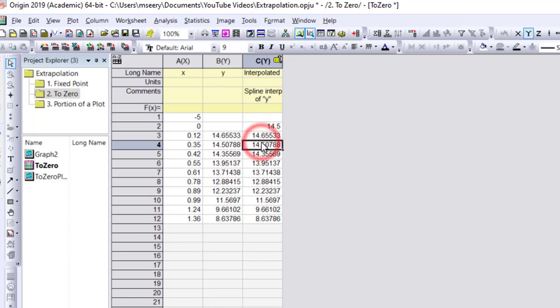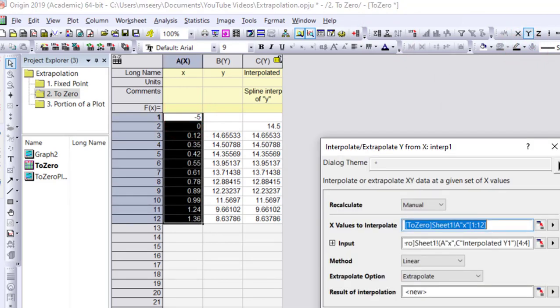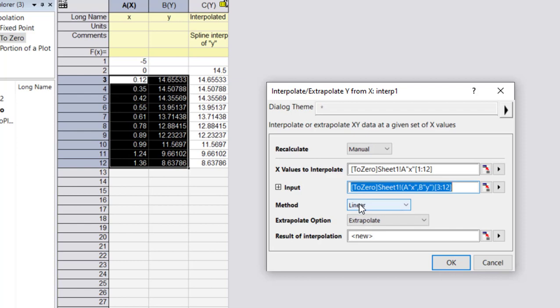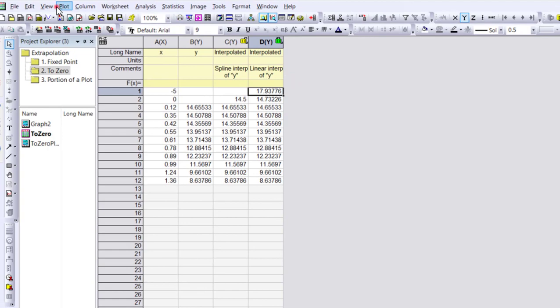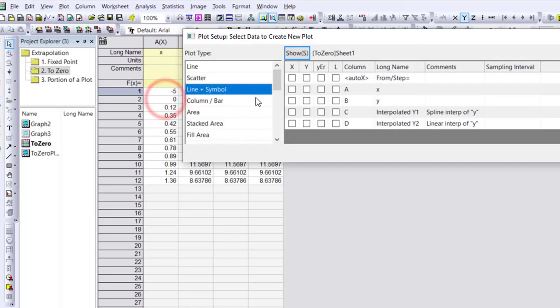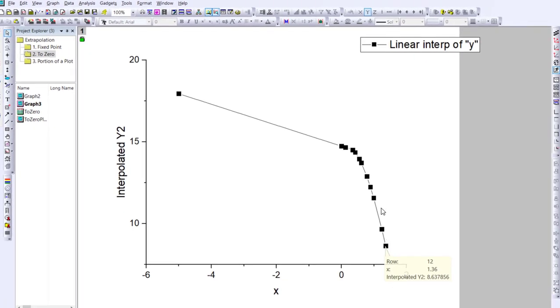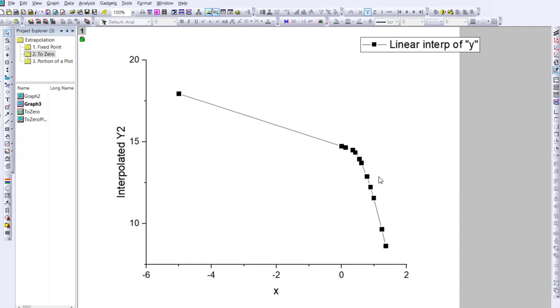Extrapolating backwards is straightforward — the trick is to insert the row with the target x value. To show the importance of method choice, let's try extrapolating to minus five using linear instead of cubic spline. The linear result gives a value of 17.9. Plotting this, we can see it's not a good fit — it's not curving. The linear method just takes a linear relationship from the last two points, which doesn't represent how the curve is actually going.